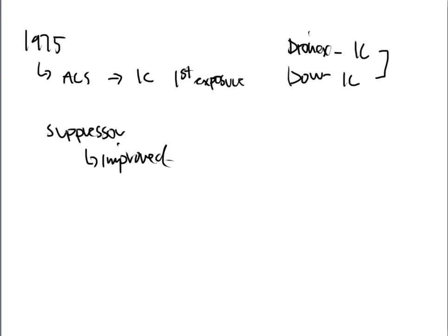Guys, welcome back. We previously discussed the launch of the IC system, and we said it basically happened at the American Chemical Society conference with a bunch of scientists around. Dionex was there selling the instrument, and Dow was there to explain the technology. And then off this process went. It took off, and Dionex made tons of money selling the IC instrument.